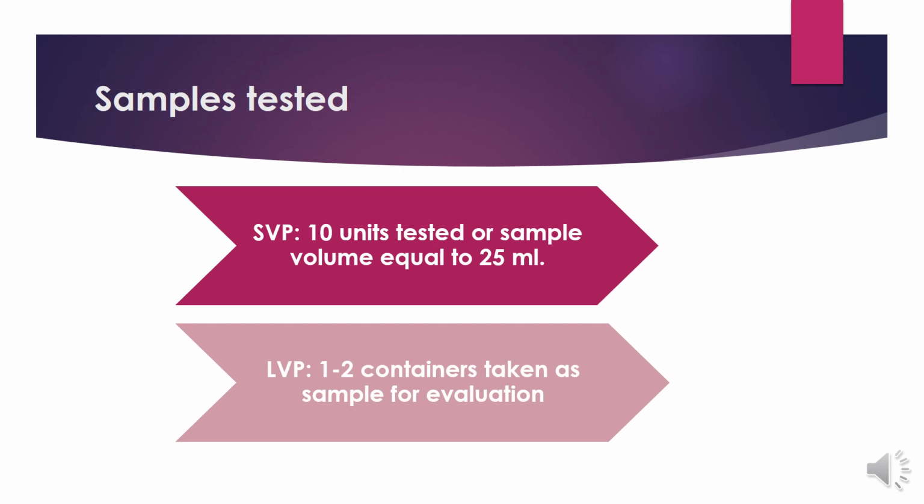So in case of large volume parenterals or LVP, we have to check at least one or two containers. So one or two containers are taken when we are dealing with a product that is an LVP, or large volume parenteral preparation.